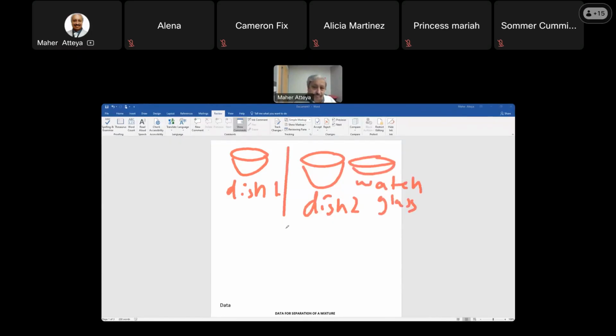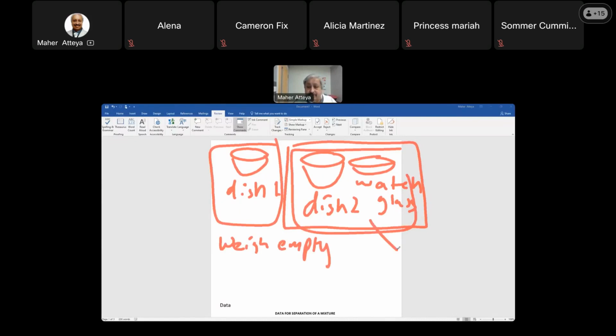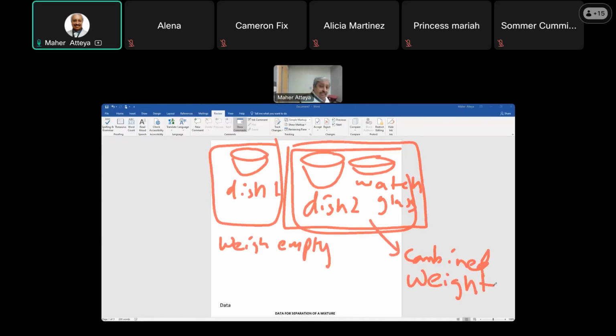So you will weigh each one separately, empty. You will weigh first what? You'll weigh each one empty, and this is the combined weight. Okay, guys? So this is what you have to do first. First, you weigh 2.